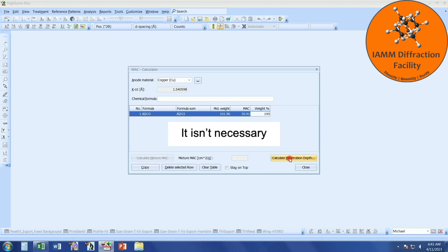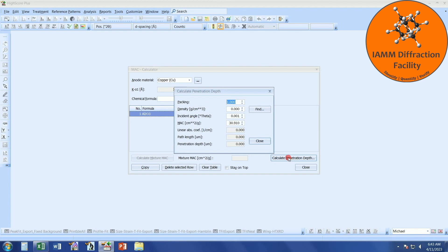Let's calculate penetration depth. This is the physical packing of your sample. If we assume that this aluminum oxide was a pressed powder, then chances are our packing would be somewhere around 0.5. If you have a nice, dense, solid piece of material, that will likely be higher. I can't tell you what you should put here — that all depends upon your sample. This is a good estimation for a pressed powder, though.